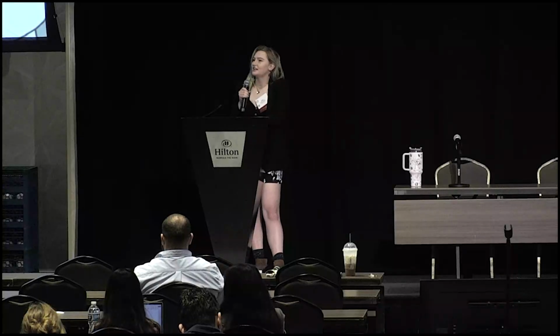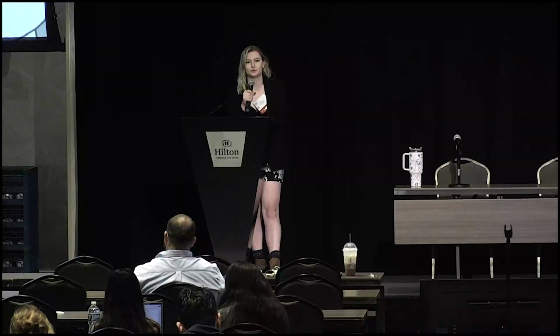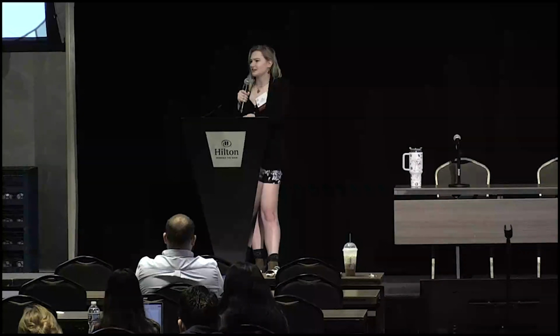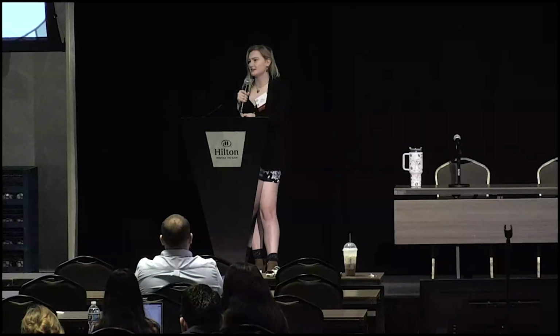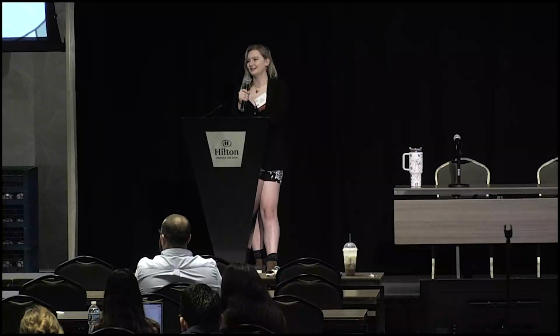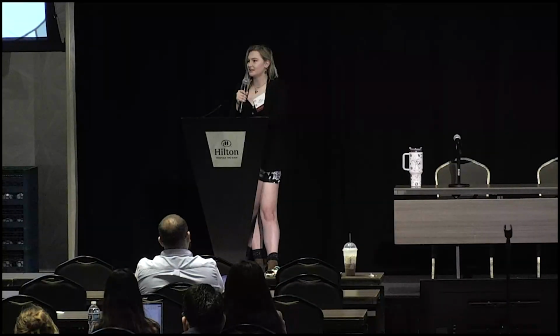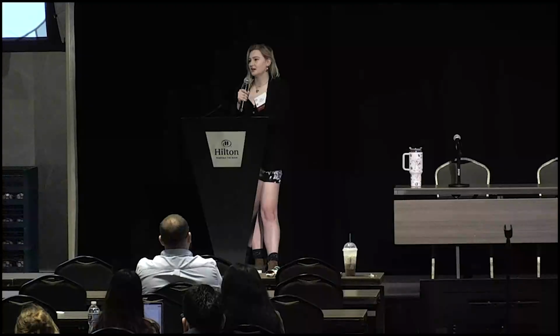Thank you for that question. So the question was, is it better to have a hybrid approach or synthesize everything or try to clone everything? It's kind of dependent, obviously, on what you're working with. If I'm trying to domesticate something and there are 3 domestication sites within like a 40 base pair range, I wouldn't really want to PCR that, so I would probably synthesize the fragment, depending on the size of it. But if it's just 1 domestication site, that's probably something you could solve with PCR. I think it's a case-by-case basis.